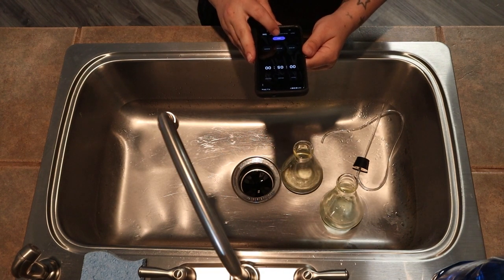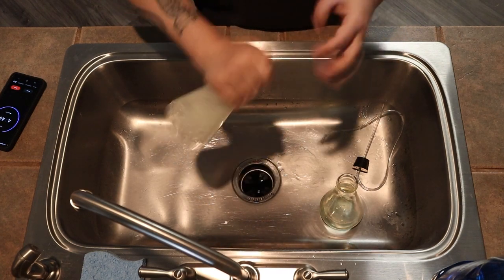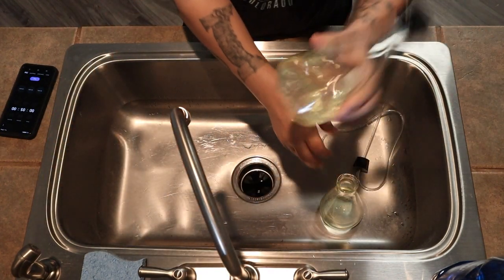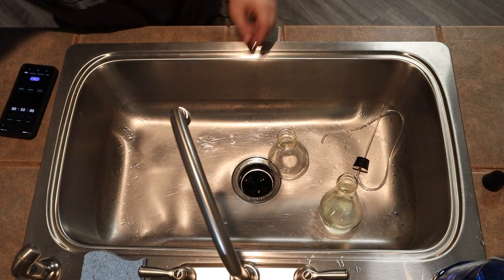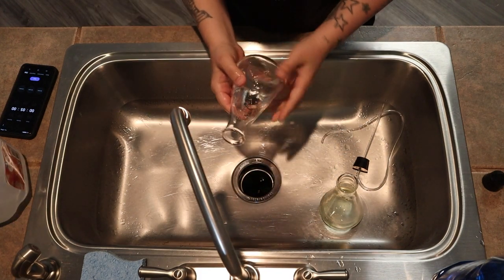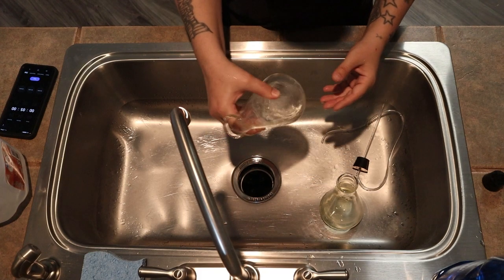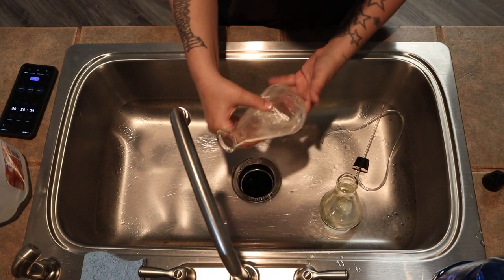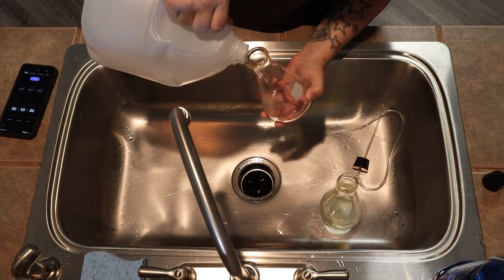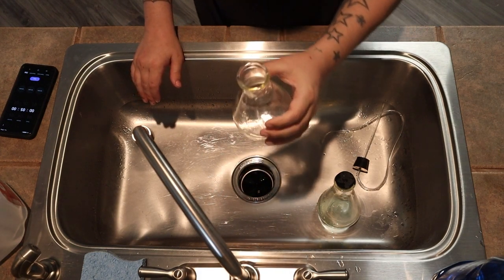I'm going to set the timer for five minutes. Make sure not to get any of this on you because if you get it on your clothes it's going to leave white marks or pink marks, so just be careful of that. Now that's done, let's pour the bleach down the drain. I'm going to use my distilled water and swish it around to get as much bleach off the glass as I can — give it a smell. I can still smell bleach, so just keep doing it until you no longer smell bleach. Okay, I don't smell bleach anymore, so this one's good.